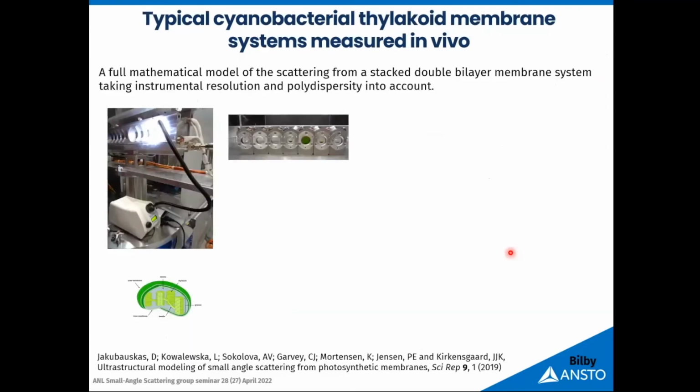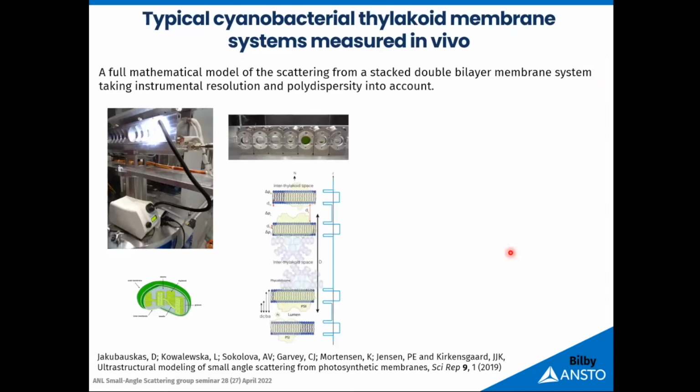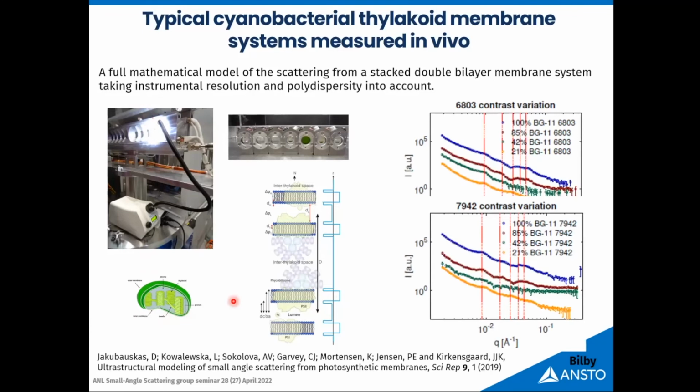Right, this example is just a bit for entertainment, because I think it's pretty cool. It's a bacteria, cyanobacteria, which has this photosynthetic mechanism inside them. And this ordered structure depends on lighting. When it has light on them, they're growing those things inside them. When there is no light, they all dissipate. It's pretty nice. And why we need neutrons here is just because we could grow those bacteria in D2O, so a bit more enhanced contrast.